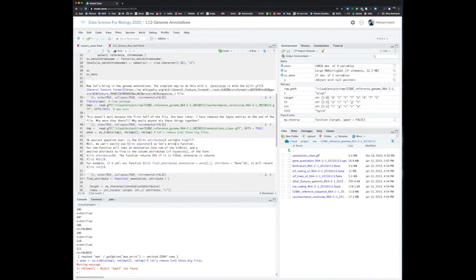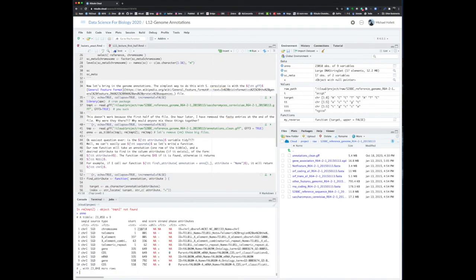Okay, so now if we look at anno, it'd be a bit nicer to look at. You can see it looks pretty good actually, and I think these columns are tidy, but then you get to this nonsense. I don't know for the life of me why they would choose to just use one character to represent all of this information. So, you'd have to go in here and pull out chromosome 1, the reference number for the NCBI, and then there's all sorts of different events that are encoded in there.